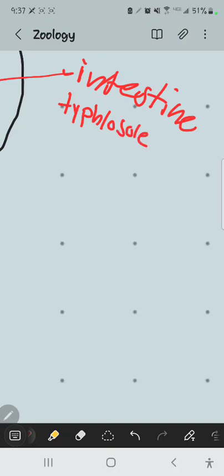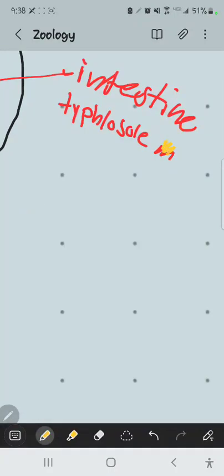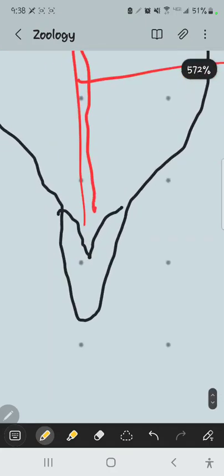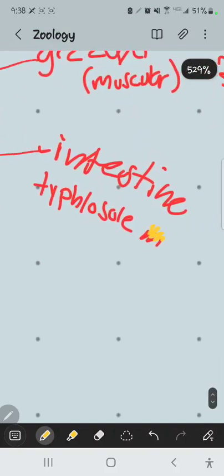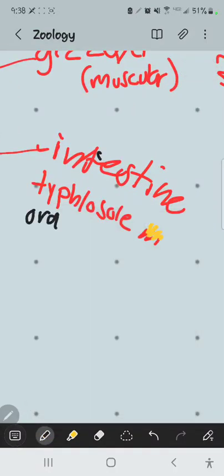That reddish-orange thing is the typhlosole here. It's the blood vessels in the typhlosole that are popping out, and it looks like ribbons, like an orange ribbon coming out of the intestine. So be sure you check the intestine out and see if you can find the typhlosole. Certainly I'm going to ask you about the typhlosole on the cross section, so be sure you see that.